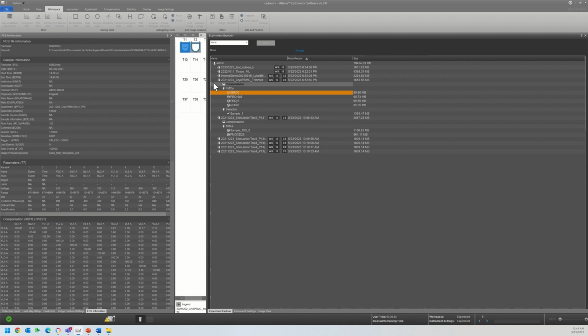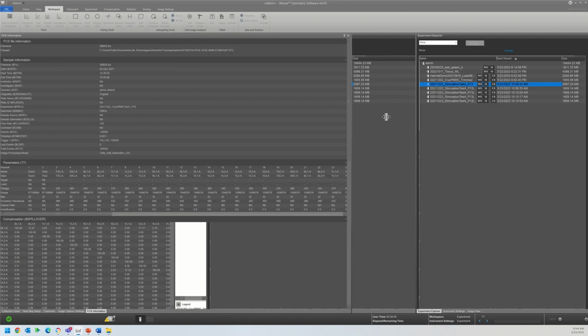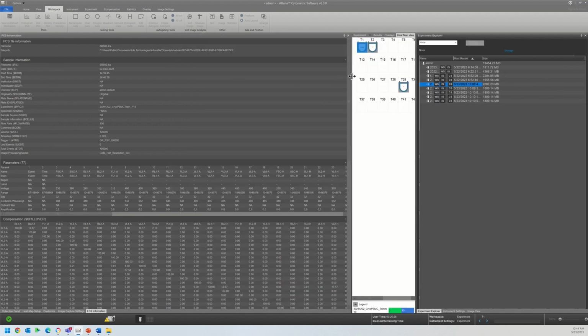And so those are the options and the steps for getting started with the image analysis. And next we'll look at the first steps to take for using these in workflows in the actual software workspace.